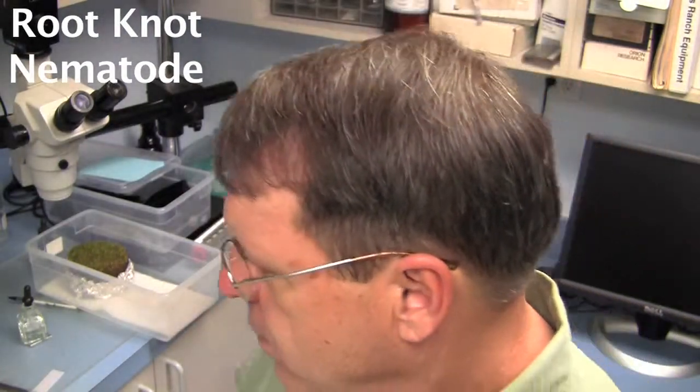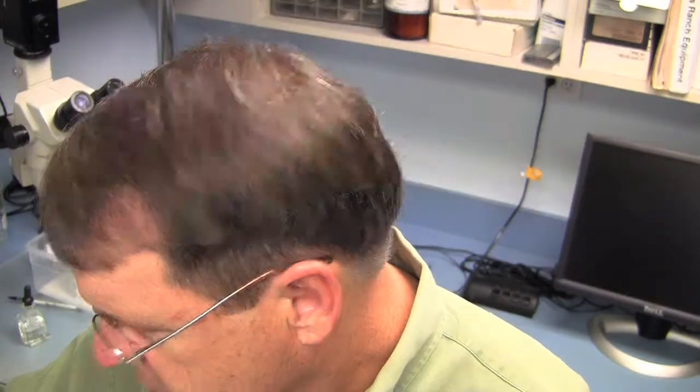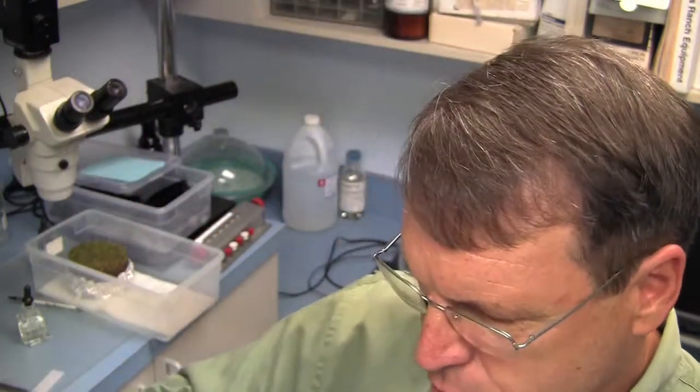Hello, this is Larry Stoll from PaceTurf. We had another sample come in this week that's got some typical symptoms. I thought I might show it to you just to give you a little look, and we'll look at it a little bit closer on the microscope. You've seen something like this before.